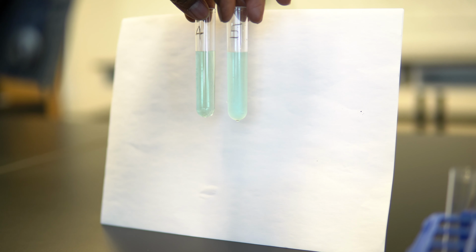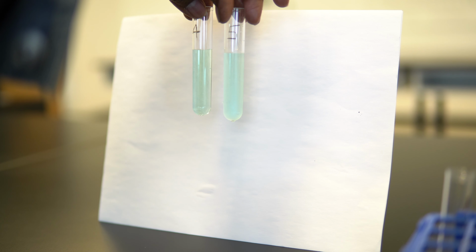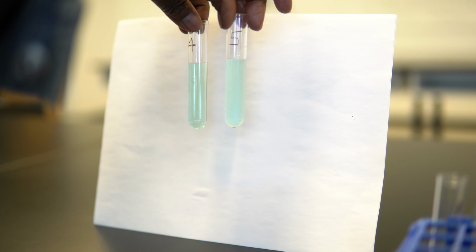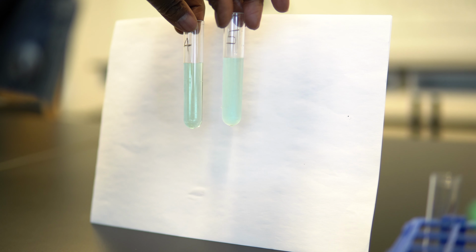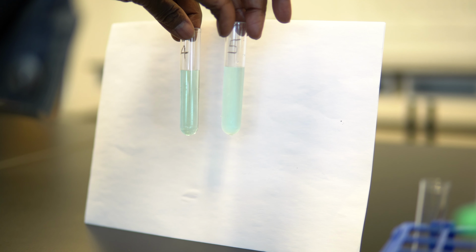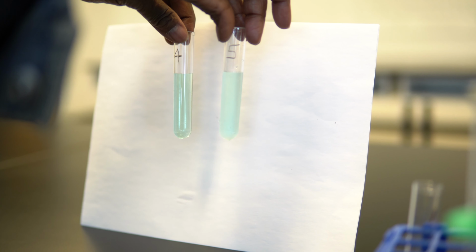Compare the color of the solution in test tube number 5 to the color of the solution in test tube number 4 at room temperature. Record the direction of the equilibrium shift in data table 2 by observing the final color. Take another photo of test tube number 4 and test tube number 5.